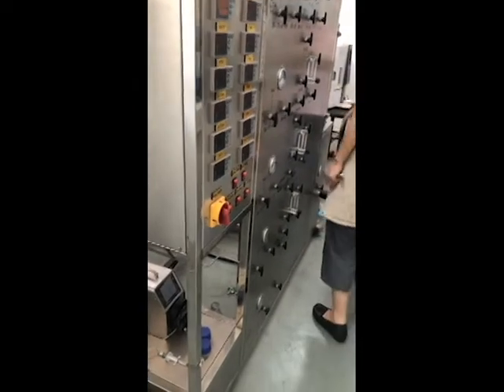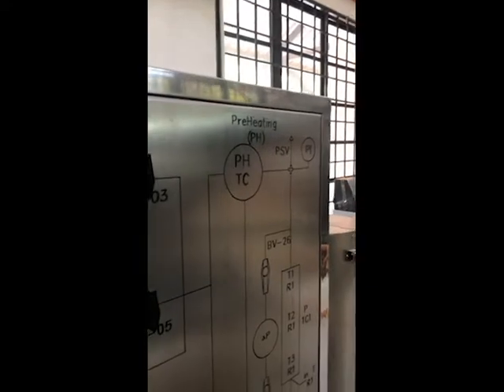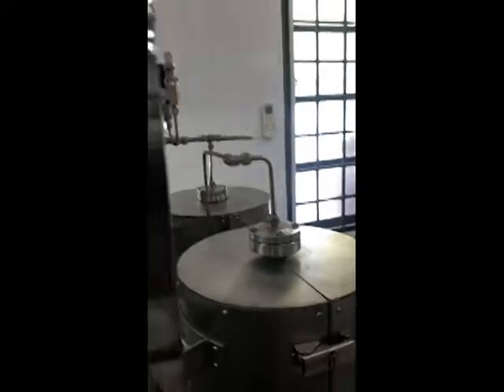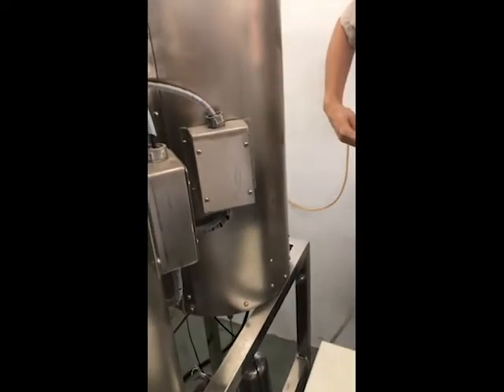Previously, we also left the gas out. As you can see here, there is the vent tube. We left the vent tube out to the room. But after several years, the tube decomposed because our condition is too tough. You can also install another tube here from the vent port until it reaches outside. This tube is here. It's open now.